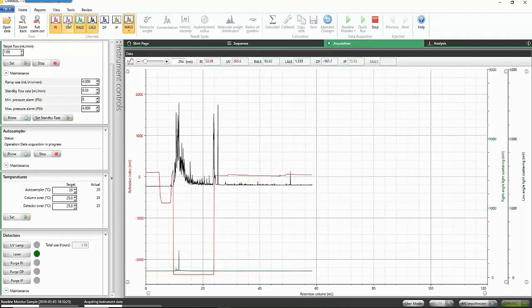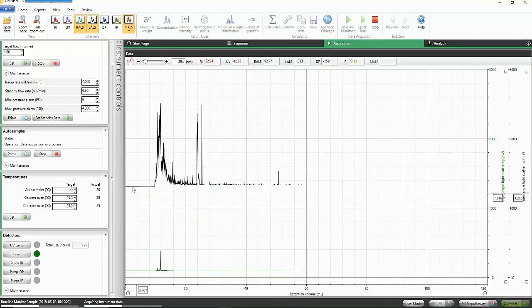Let's look at the light scattering detectors. Again, the baselines were nice and stable. Then the water came through, and there was a little bit of noise and spikiness on both detectors. Not really a cause for concern because it passed through over a few minutes, came roughly back to baseline, and you can see those few spikes in the loads were clearing up, and it was all settling down again. So that looks good.